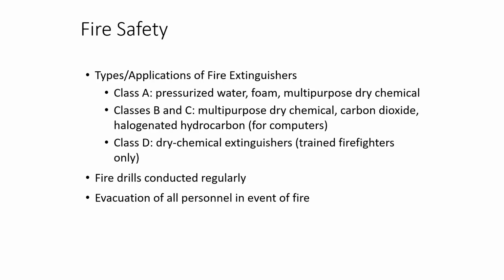Fire drills should be conducted regularly, with evacuation of all personnel in the event of a fire. There should be an evacuation plan, and that should be communicated to each employee.